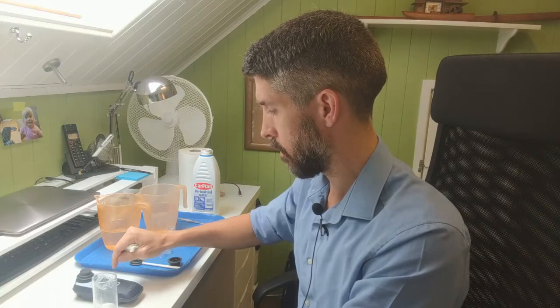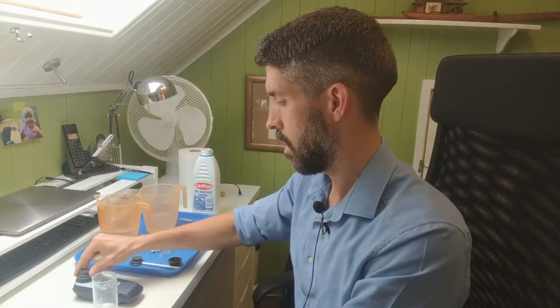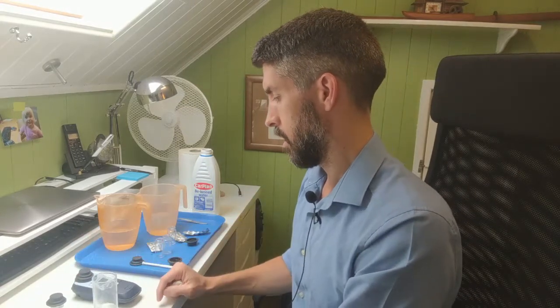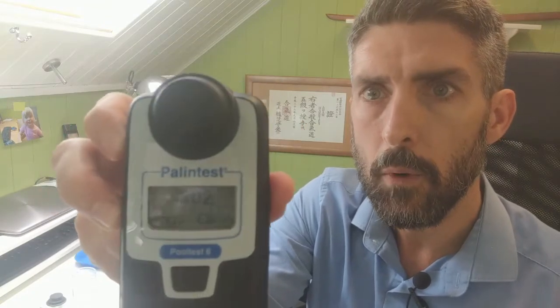Get a blank, get it on zero, and then put the sample in and get a reading. What we've got here is - I hope you can see that - 4.02.